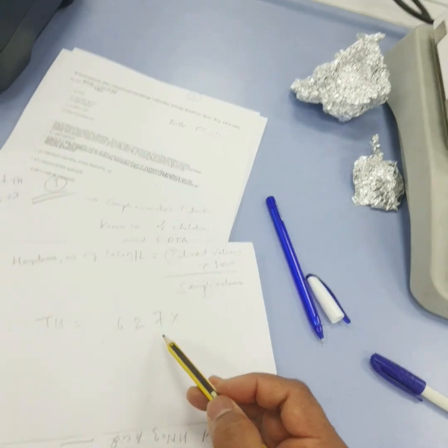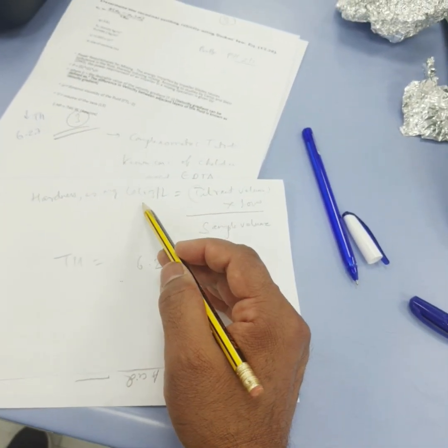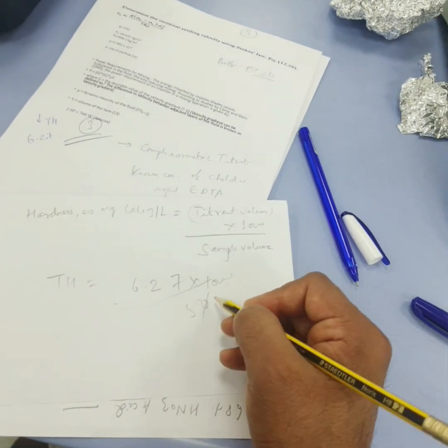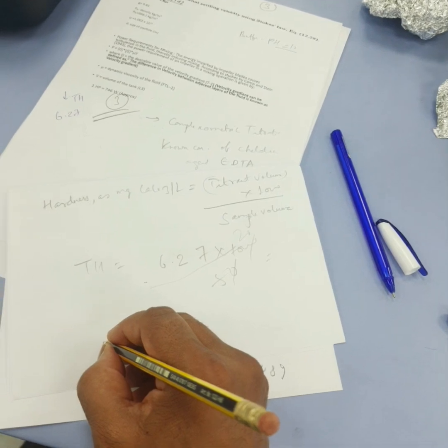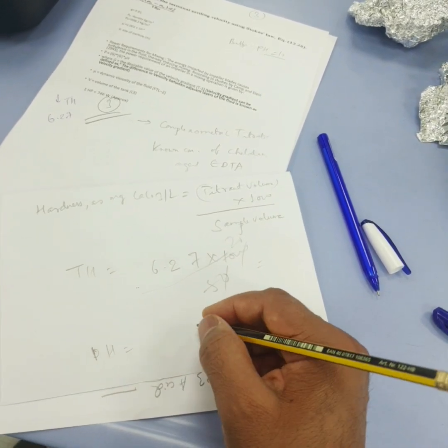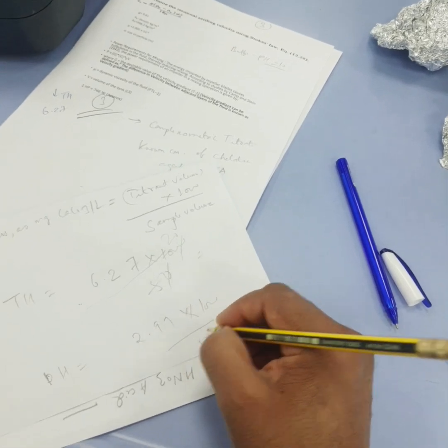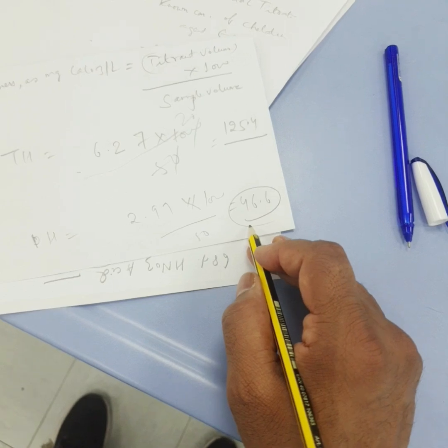So total hardness in the first case, 6.27 ml of the EDTA was consumed. The hardness expressed in terms of calcium carbonate per liter is equal to titrant volume into 1000 upon sample volume. Here the sample volume is 50. Similarly, the permanent hardness is equal to 2.99 into 1000 upon 50. Here you can see the total hardness is 125.4 and the permanent hardness is equal to 46.6.